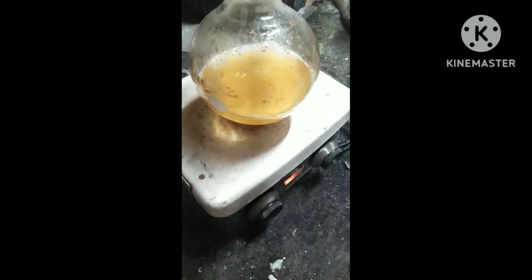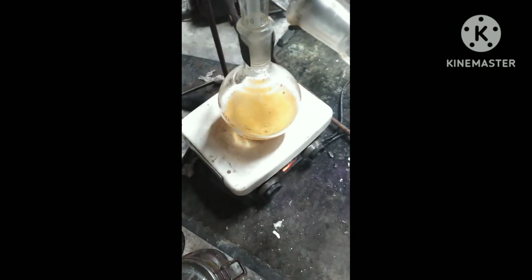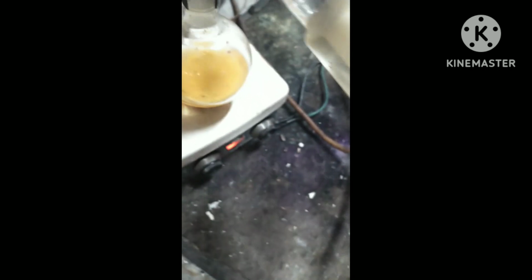You want to add enough hydrochloric acid to saturate your mix really well, because we're going to heat it and it has to be able to dissolve it all into solution. You're going to want to do this outside if you don't have a fume hood, because we're going to boil off some of the water and hydrochloric acid. I'm going to start that process now.